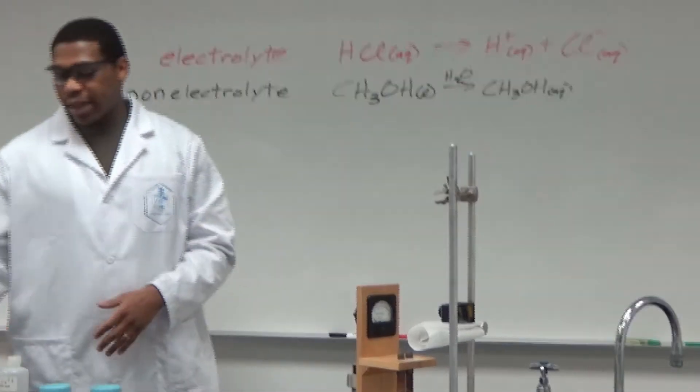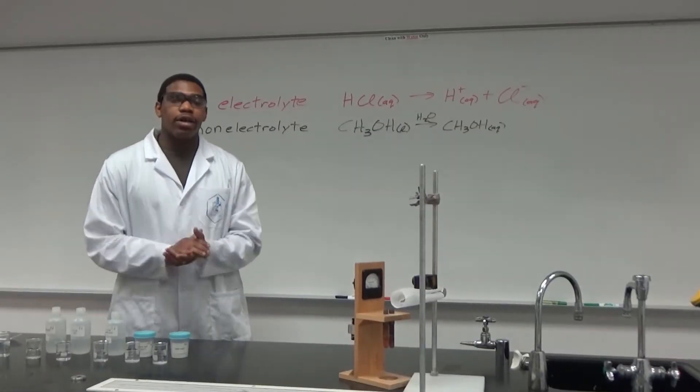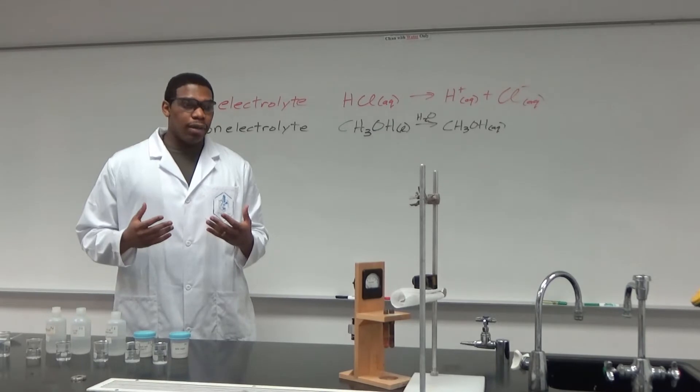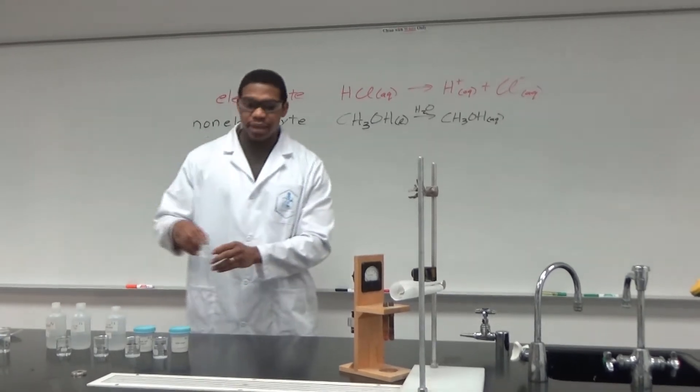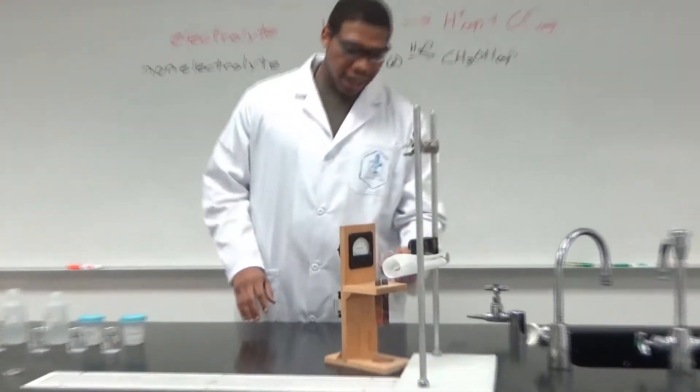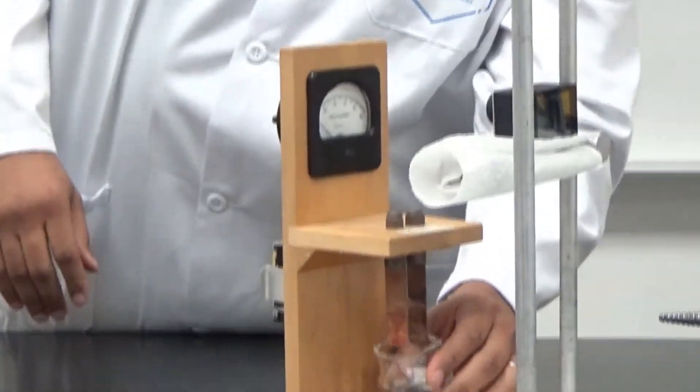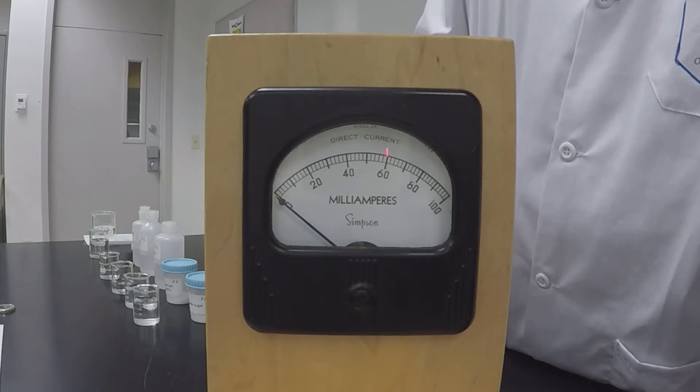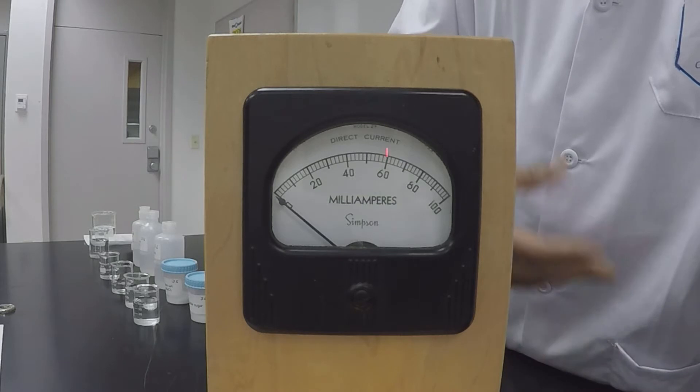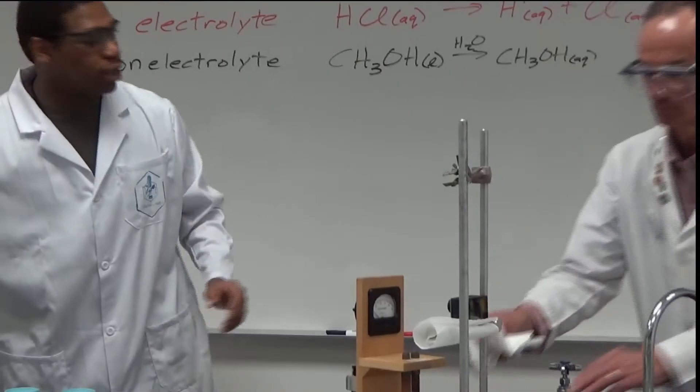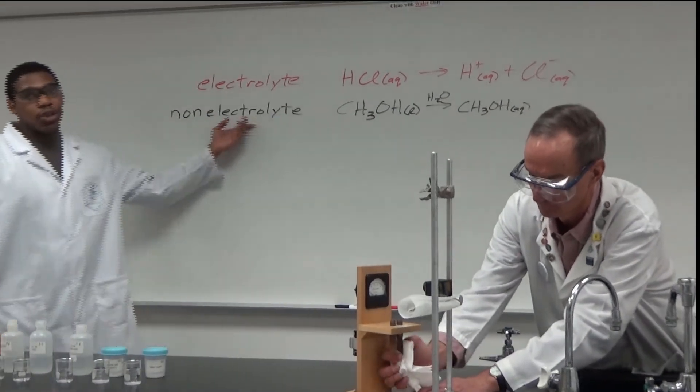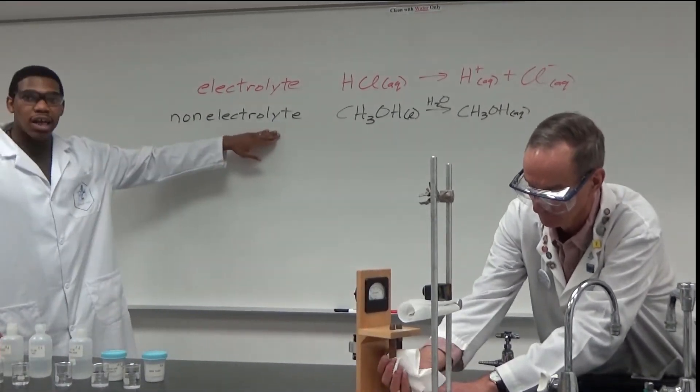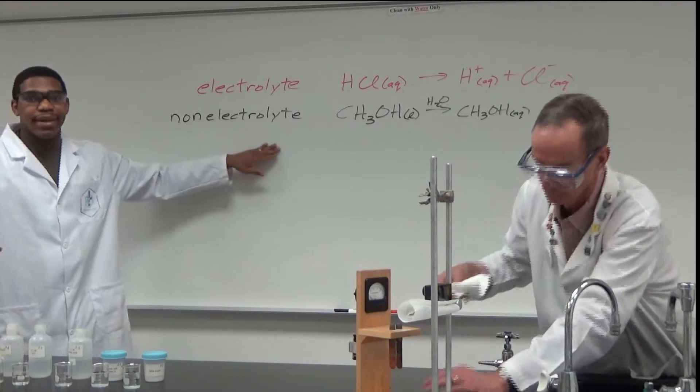Because of that, it does not have any ability to generate movement of ions. So if we take this methanol solution and place it inside this conductivity meter, as you can see, there's no movement of the arrow. This solution is not conductive. What we would call this is a non-electrolyte solution. Non-electrolyte means that it's not conductive.